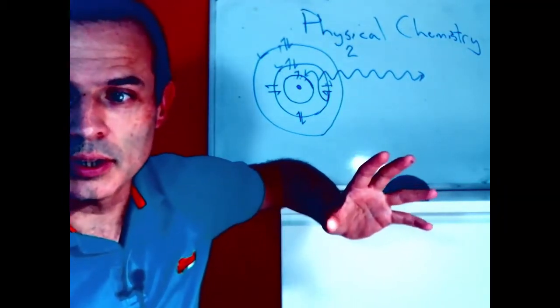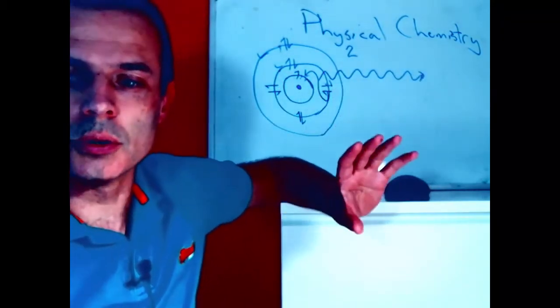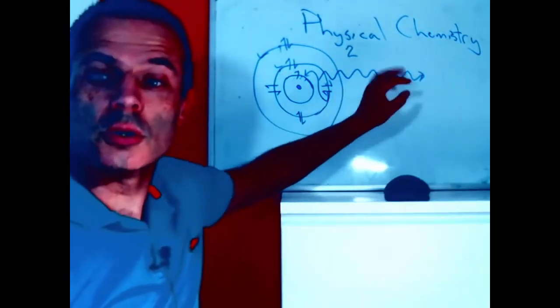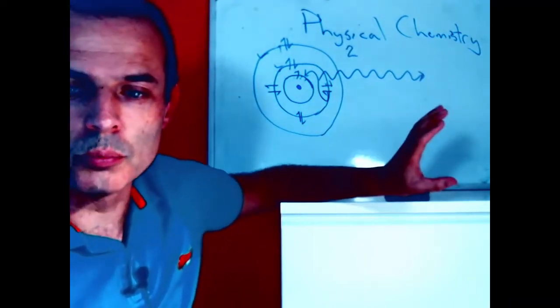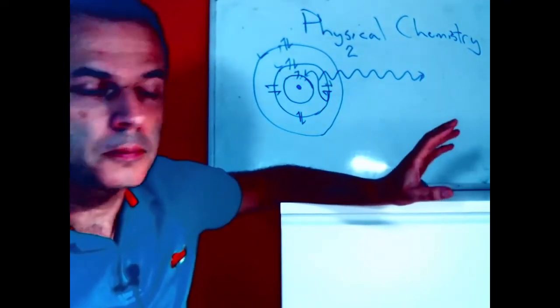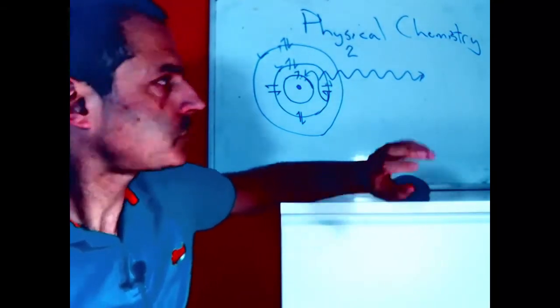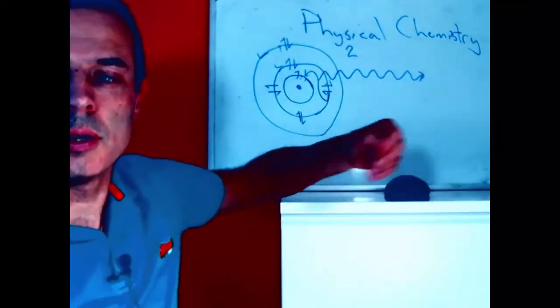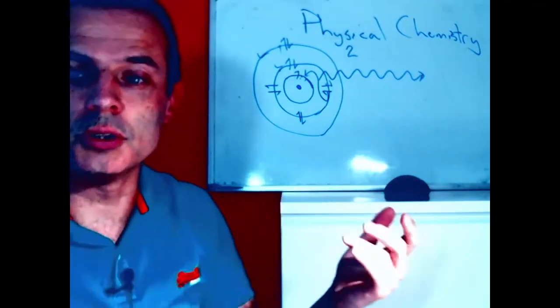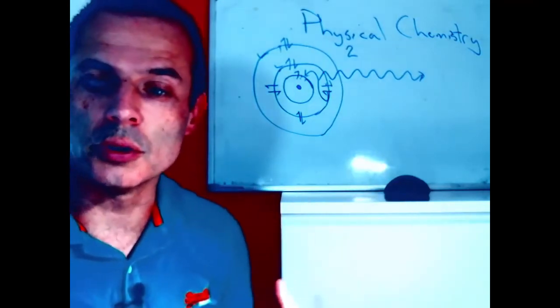It is also an excellent technique because we don't need a vacuum. We've got an X-ray coming in and an X-ray coming out, so we can also penetrate relatively deeply inside our sample, although this X-ray is not that high energy, and so it won't penetrate so far, but it's way better. This technique is often used to check the purity of metals, for example, because you can easily shine an X-ray in and measure the X-ray, it's quick, and you can do it in air, so you can come up with a box. Obviously you don't want the X-rays to escape, but you can hold it up against your sample and measure it, so you don't even need to take it with you.